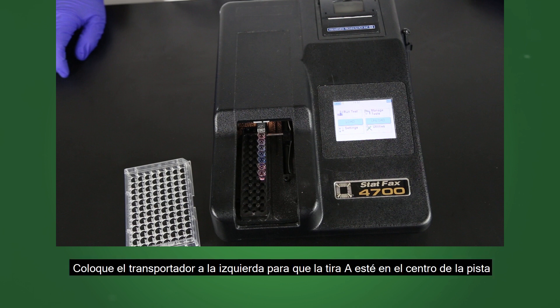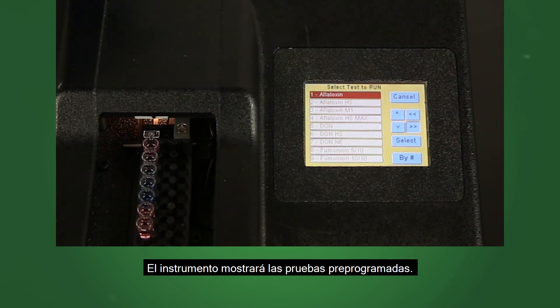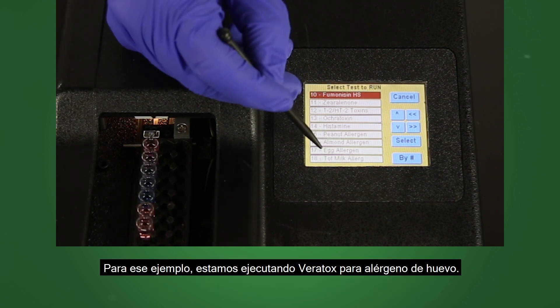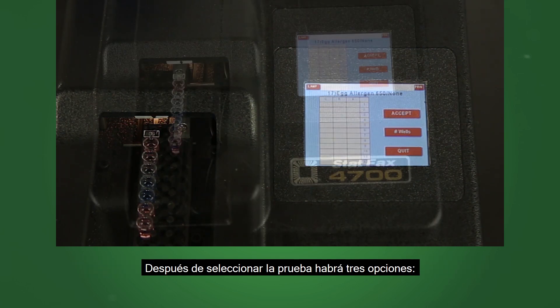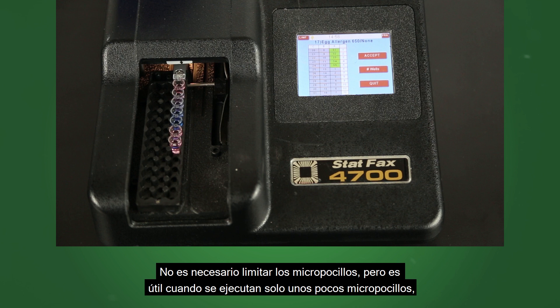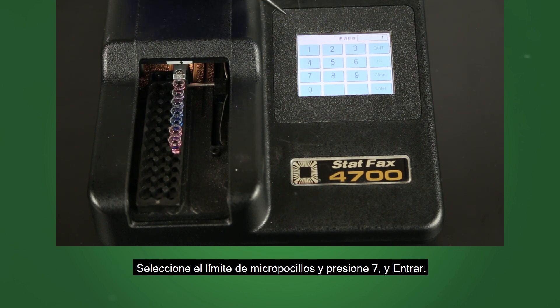Using the 4700 reader, position the carrier to the left so strip A is in the center of the track. Use the run test key to access the user's test menu; the instrument will display the pre-programmed tests. Press arrow up or down or advance page to locate the correct test, or if you know the test number, press by number, enter the test number and press enter. For this example, we are running the Veritox for egg allergen. Confirm the test selection or press no to select a different test. After selecting the test, there will be three options: accept the test, limit the number of wells, or quit the test. Limiting the wells is not required, but helpful when running only a few wells, as the reader will read all 12 positions unless limited. Select limit wells and press 7 and enter.